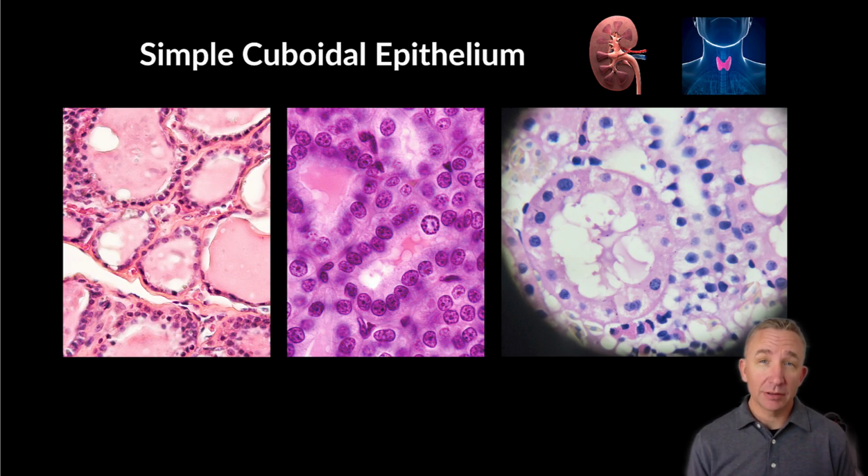So as I look into microscope slides, I try to change it in the sense of, what do I actually see to help remember what I'm looking at inside the microscope? To me, these look like a bunch of pearl necklaces, just at different magnifications.